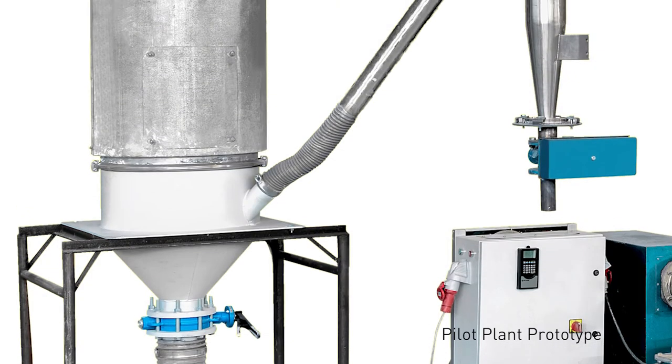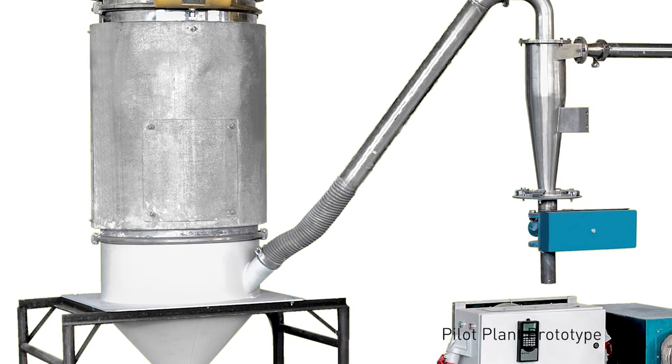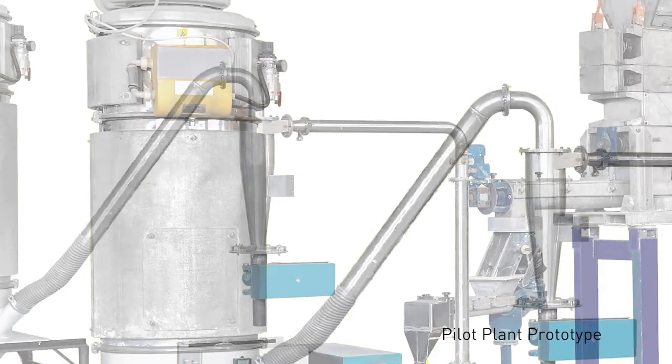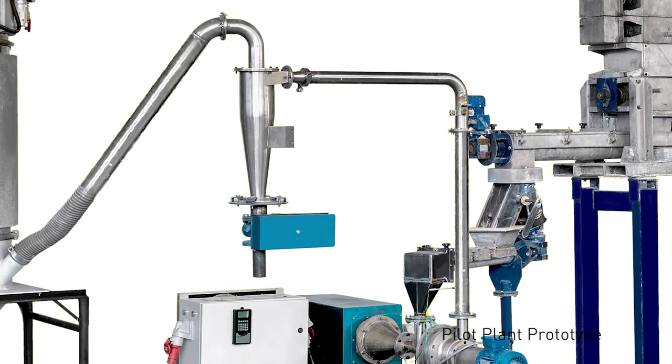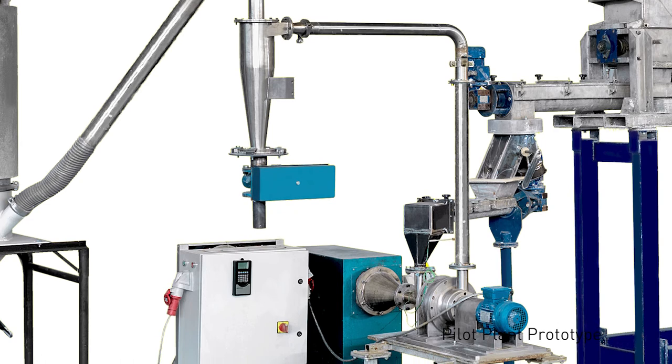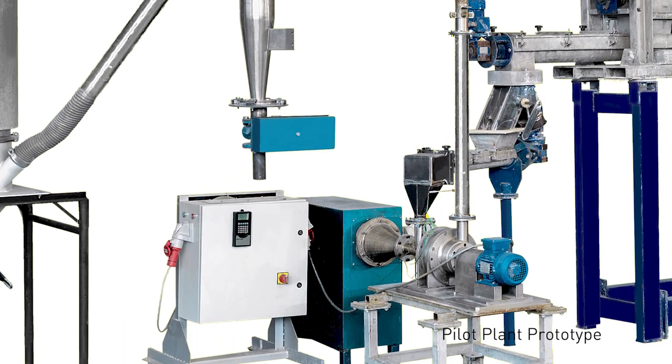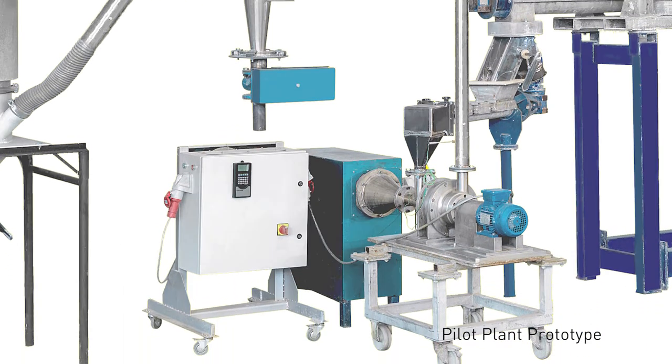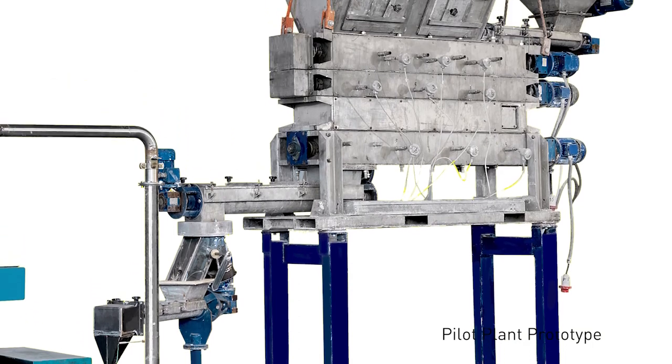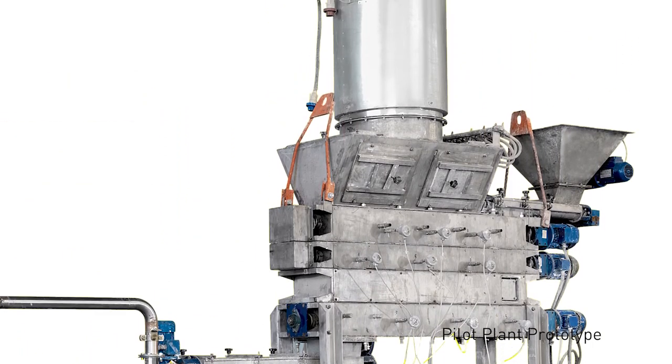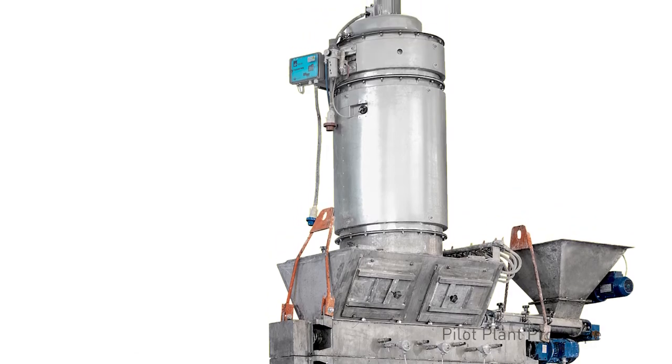Cimprogetti, thanks to an innovative pilot plant, has developed test protocols calibrated according to the characteristics of the different raw materials. Accurate raw material characterization will be combined with multiple tests executed with our pilot plant reproducing industrial plant process conditions.